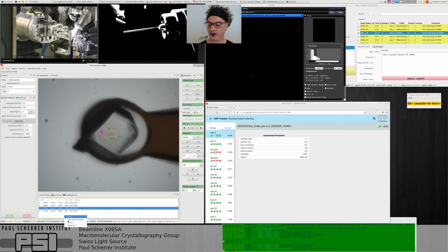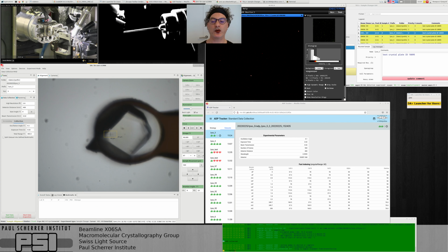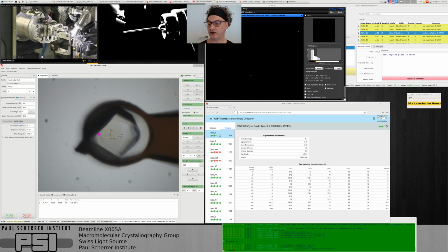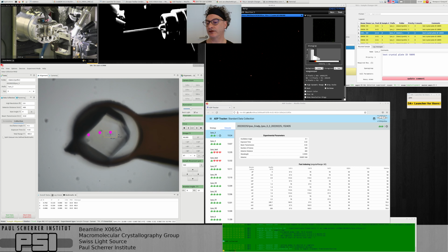I think I should remove them all first, because I had old positions over there. So you can right click and add a bookmark to a position. You have to make sure it's centered first. You go to the next position, make sure it's centered. You can add by using the B key on the keyboard. It's a shortcut. So you can do another one. Good, B. So we have 3 positions, that should be enough.